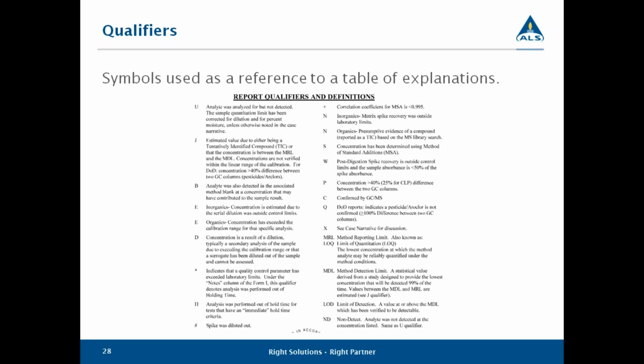So this is good information here. If you see a flag on a report and you go to the key and you don't understand, I would encourage you to call your laboratory so you can fully understand what impact this flagging has on your samples. Because this is really what it's all about. You want to make sure you understand the data, and laboratories want you to understand the data so that it's of most use to you and to your clients if that's the case.